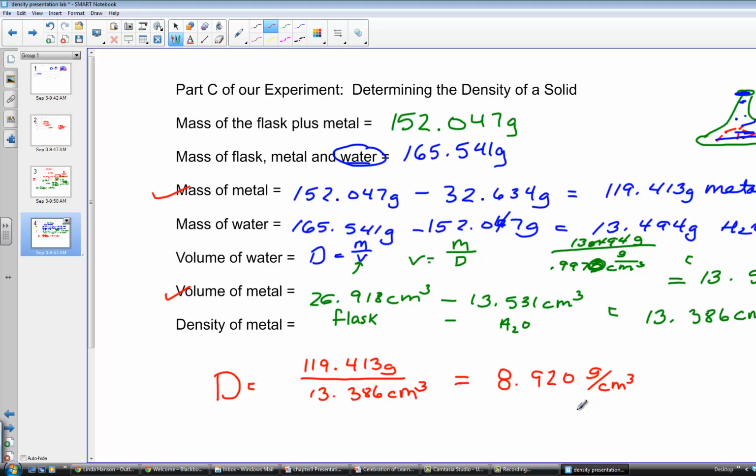And friends, there really will be correct answers when you turn your lab reports in. So practice the skills of being a good measurer. We want to create accuracy and precision so that you won't lose points on your lab report for turning in incorrect answers. In other words, your calculations may be correct, but there is a correct, accurate answer. Aim for that. And we'll see you in lab.